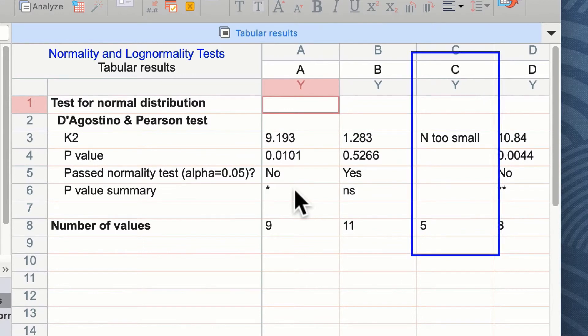Group C, the data set are too small. We only have an n of 5 here, and this was not able to do a full normality test on it.